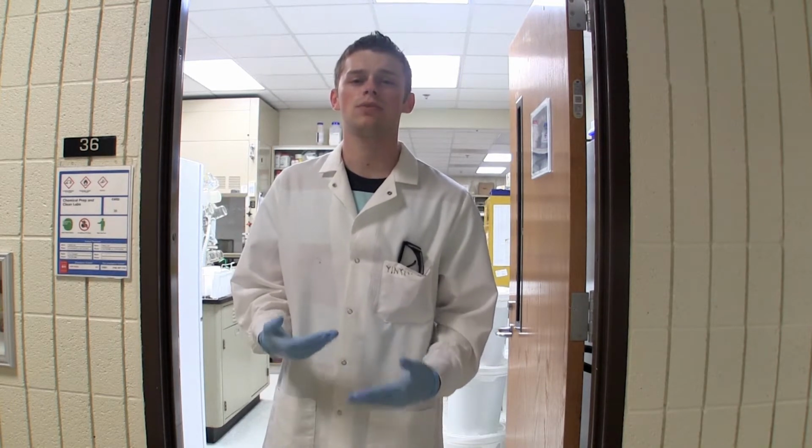Today, I'll be running a staining procedure utilizing the chemical compound DAPI. I will walk through this procedure while also providing a little more insight into the sort of research I do here at the University of Michigan. The general procedure we follow can be divided up into 4 distinct steps: sampling, filtering, staining, and counting.